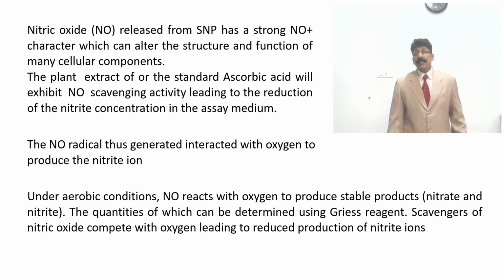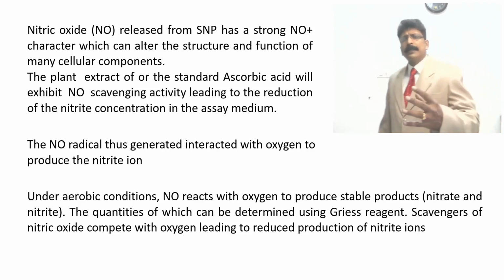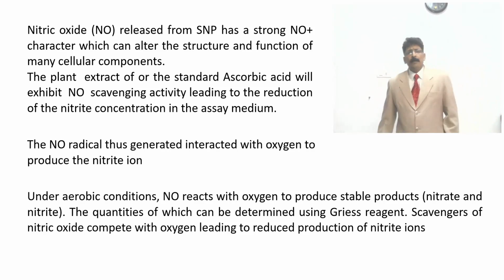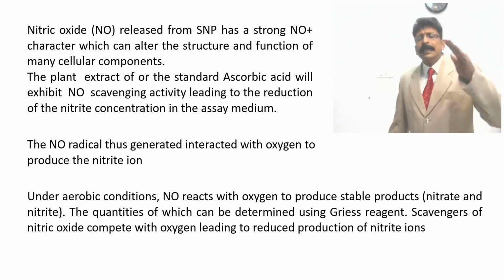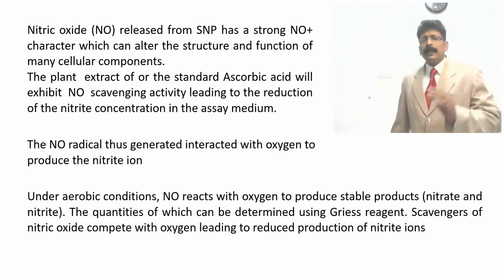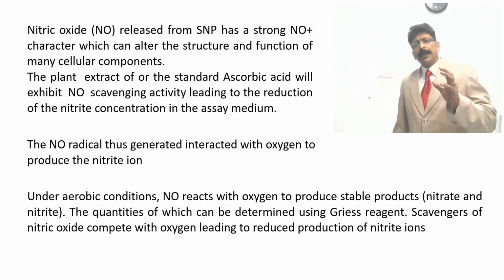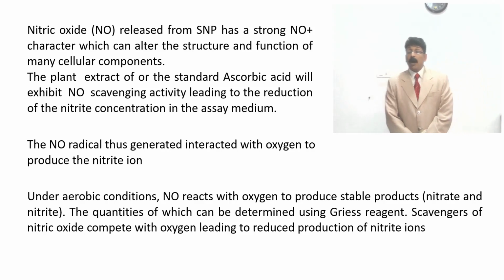So if your extract has more scavenging effect, it will automatically reduce the NO production, the NO radical, so that you can see the depth of the color, or the depth of the diazonium salt production can be inhibited.